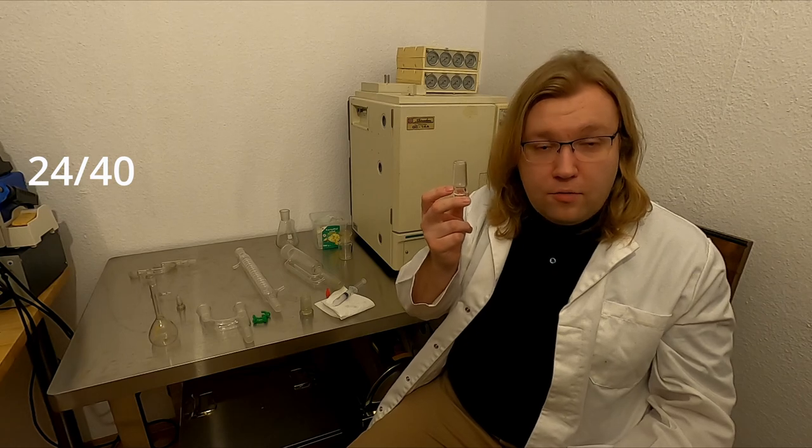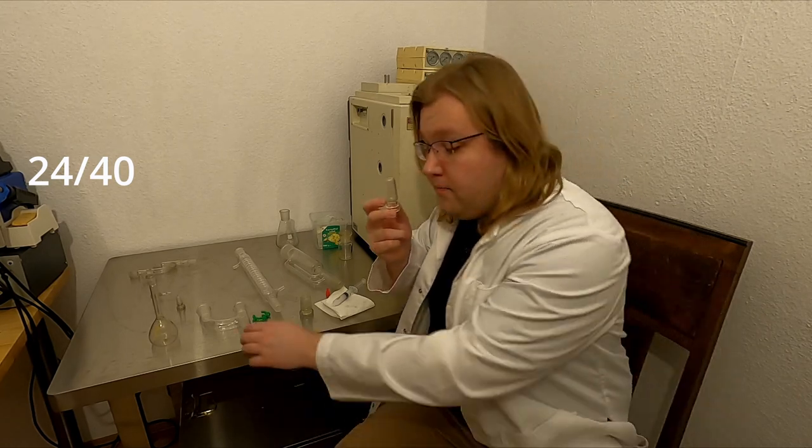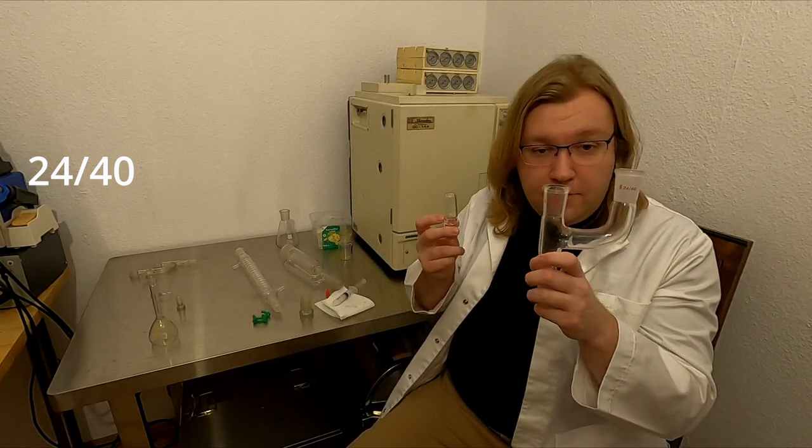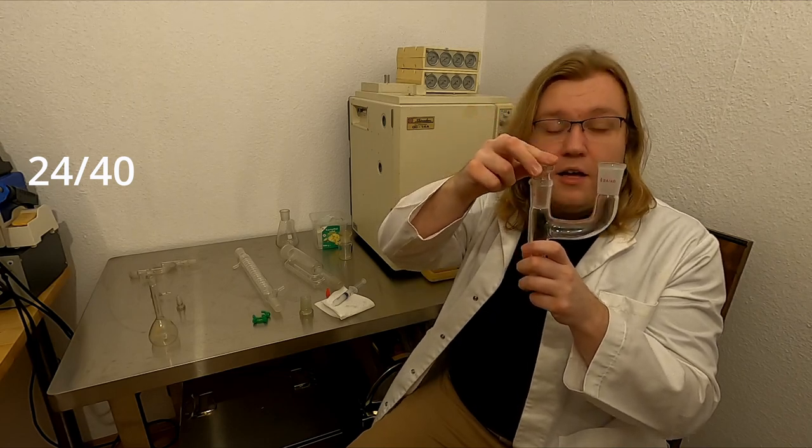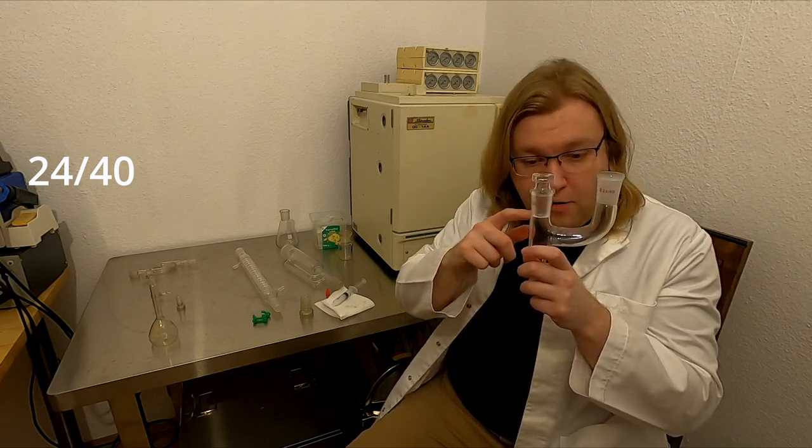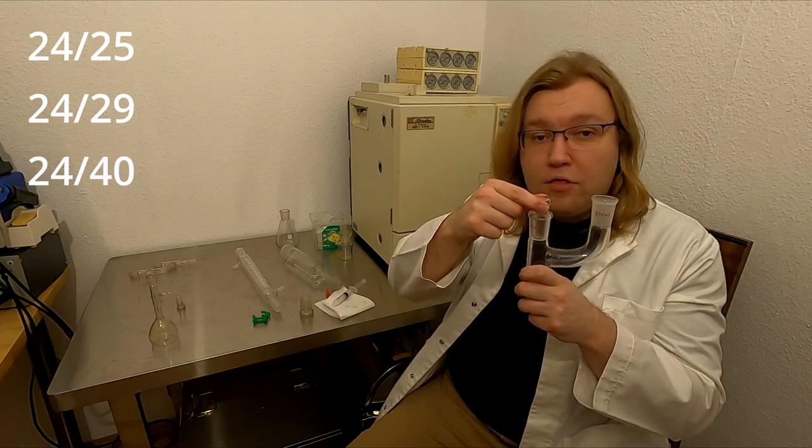This joint can fit with other 24/40 glassware, such as this Claisen adapter, as well as most other 24 glassware, even if it doesn't have the same length.